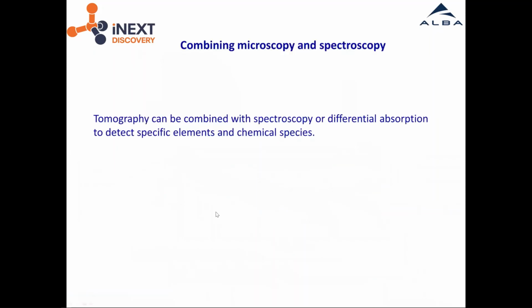So with this, what I wanted to tell you is, in addition to getting the structure within the cell, you can also have, by differential absorption or by directly doing spectroscopy, so the full spectra, you can tackle which are the chemical species that you have in your cell.